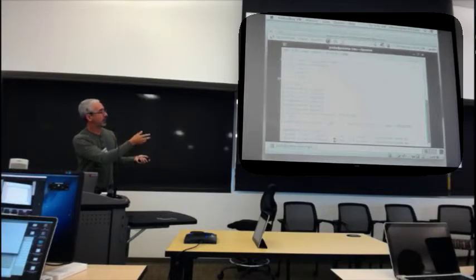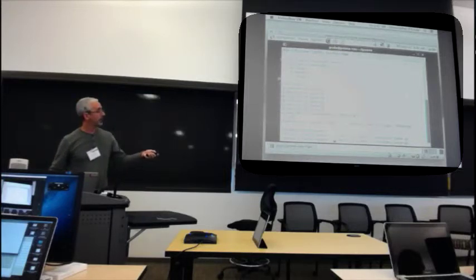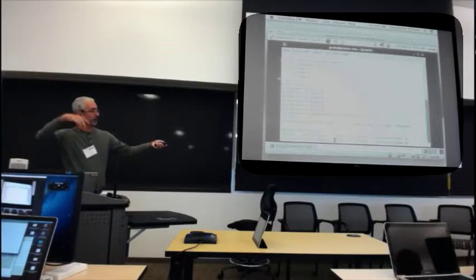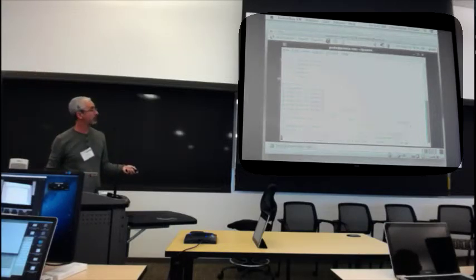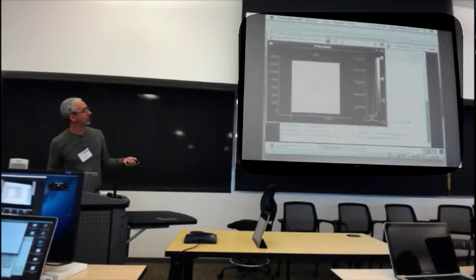So this is going to launch it. It's going to run this little 46-line script, which we'll look at in a minute. And it's going to send out the monitoring data, in principle, to another node, but I happen to be running it on the same node. There it goes, and there's your real-time plot. You're looking at the image. Oh, it's getting too bright. You want to grab it, rescale it.